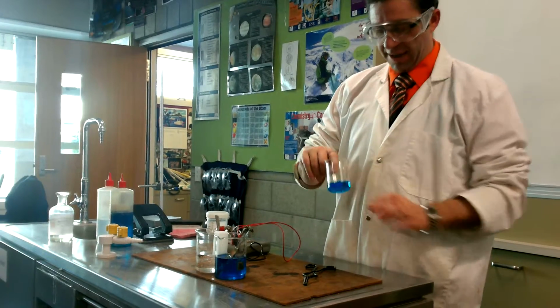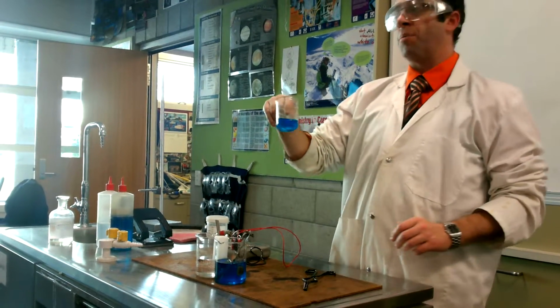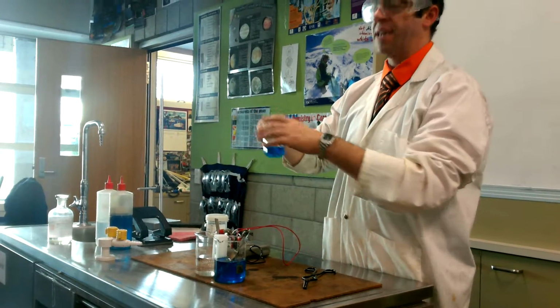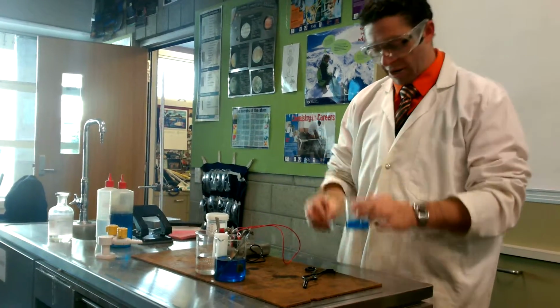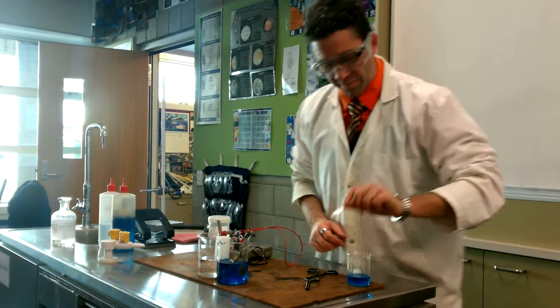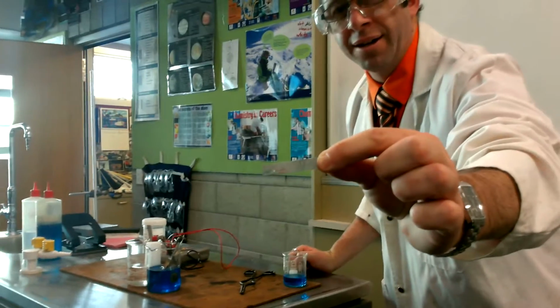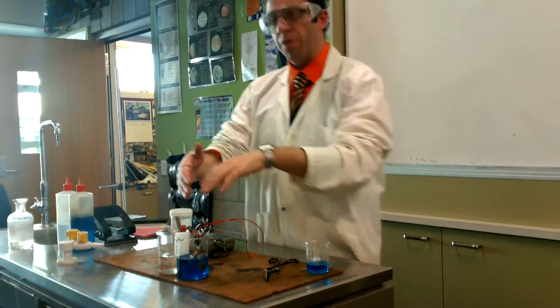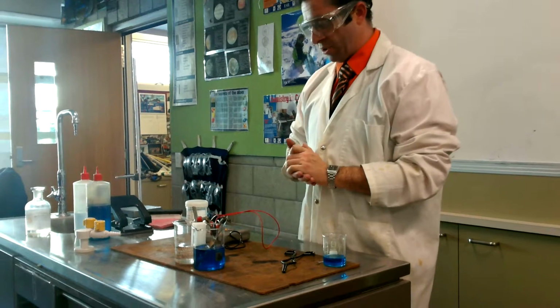Because zinc oxidizing and copper reducing has a positive E0 value, is spontaneous, then we can actually use this idea to create a thing called an electrochemical cell. And, sorry, just some people didn't believe me there, just to show that is actually quite pink. Okay. And that's what this is. This is an electrochemical cell.